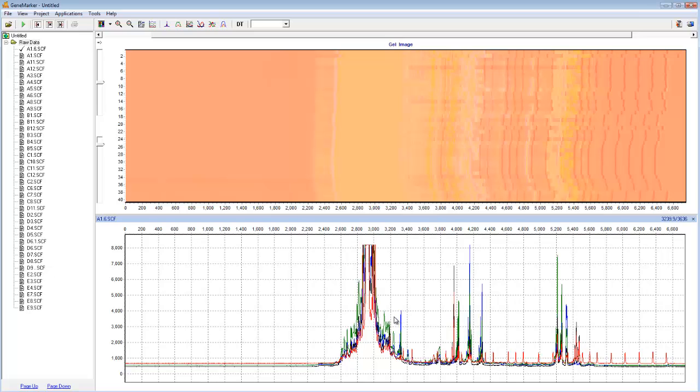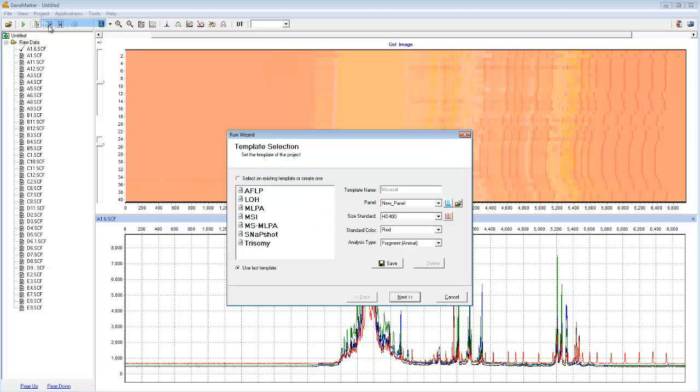We can now see that I've successfully imported the raw data. I'd like to point out specifically that this is microsatellite dinucleotide data. However, I want to emphasize that the methods we're going to cover in this webinar for creating custom panels apply to all analysis types and all data types. Now go to the run wizard by either clicking on this green arrow, or by going to Project, Run.